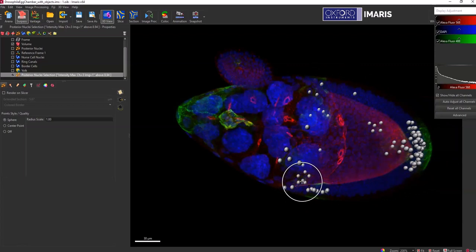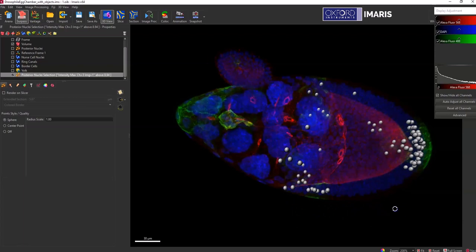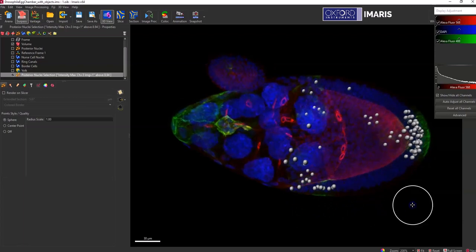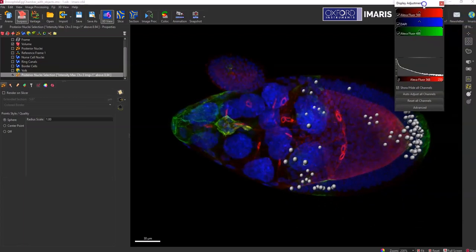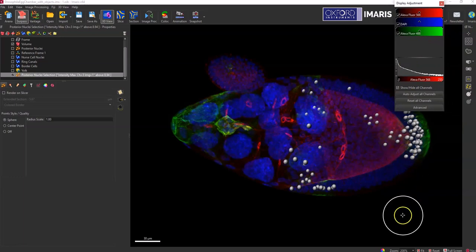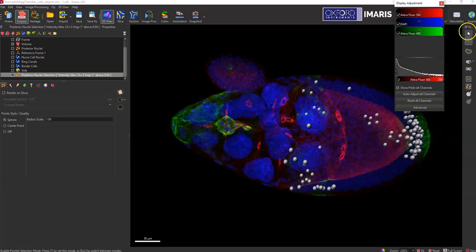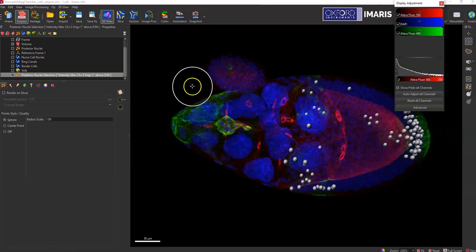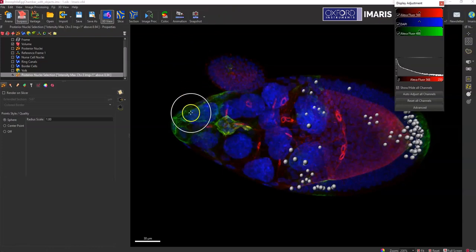You can do that for any statistic that's generated. So those are a couple of different ways of creating a subselection or a selection of your objects based on either clicking them and holding the shift key with the pointer or the circle tool or using statistics to select the objects that you're interested in. Let me know if you have any questions.